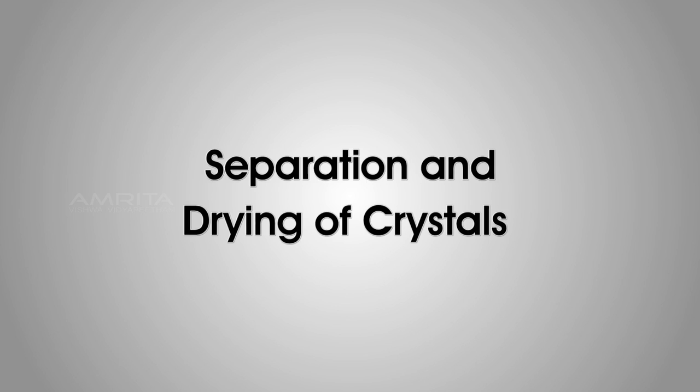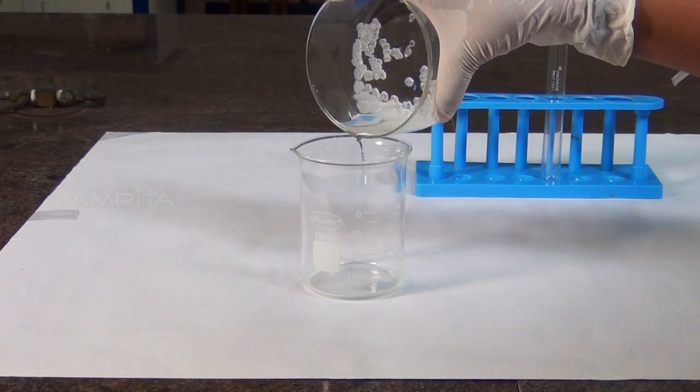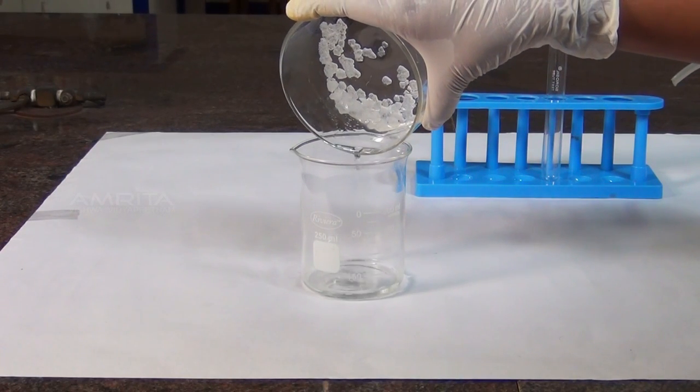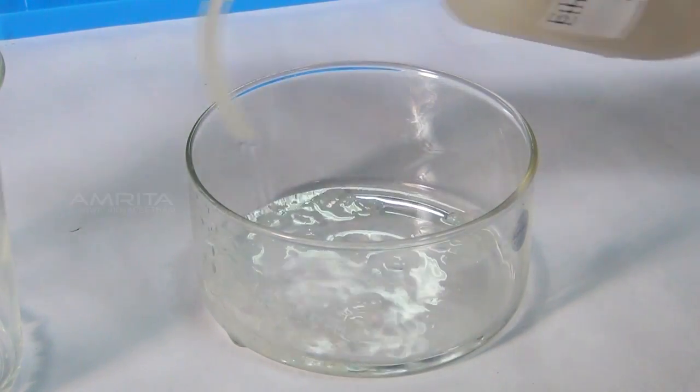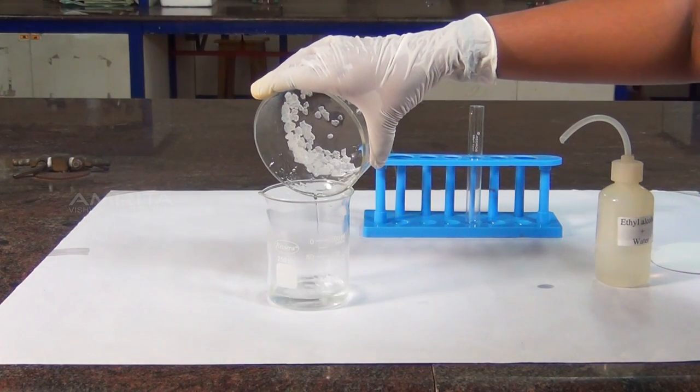Separation and Drying of Crystals. Decant the mother liquid carefully into a beaker. Wash the crystals three or four times with a little ethyl alcohol containing a small amount of cold water.